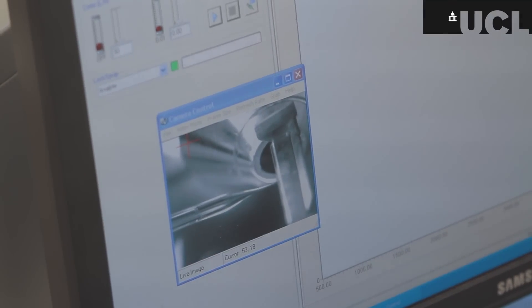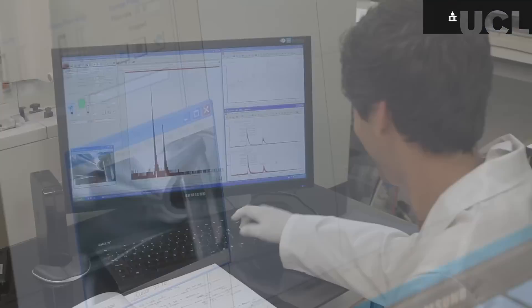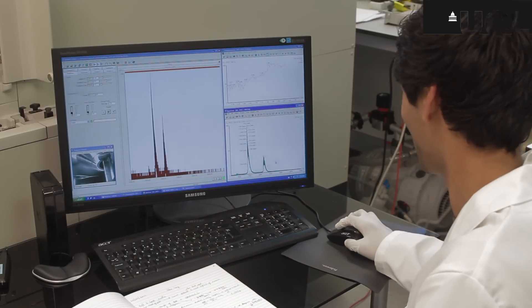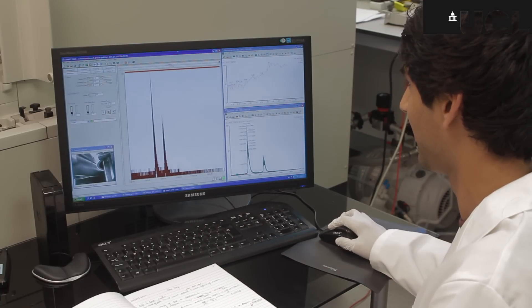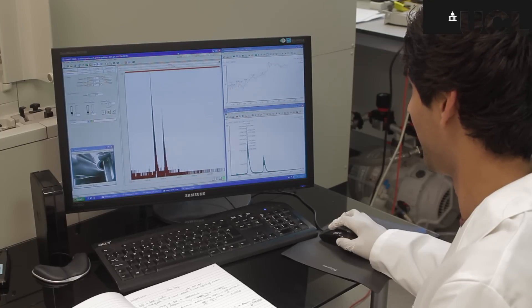Settings need to be delicately altered in order to allow good high throughput data. Here we can see detection and formation of a mass spectra of cytochrome c. The data is accumulated and collected into a spectra which happens over a time frame of around three minutes.